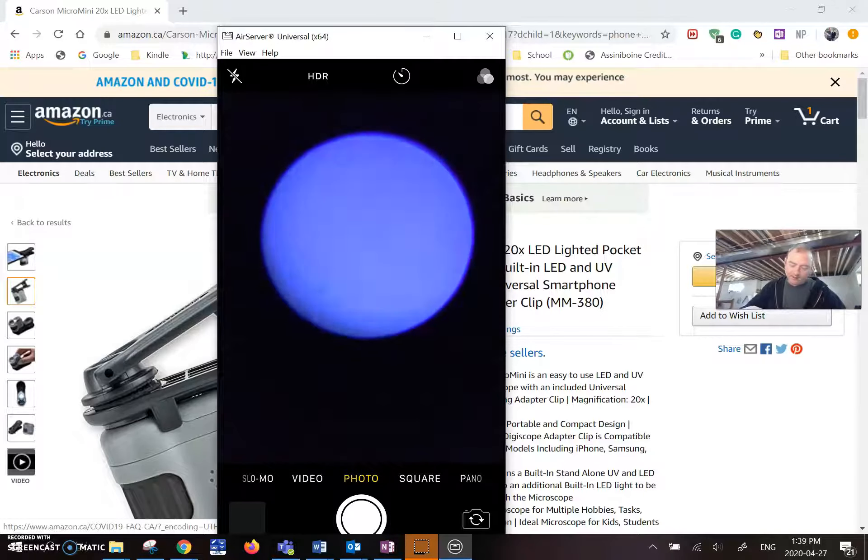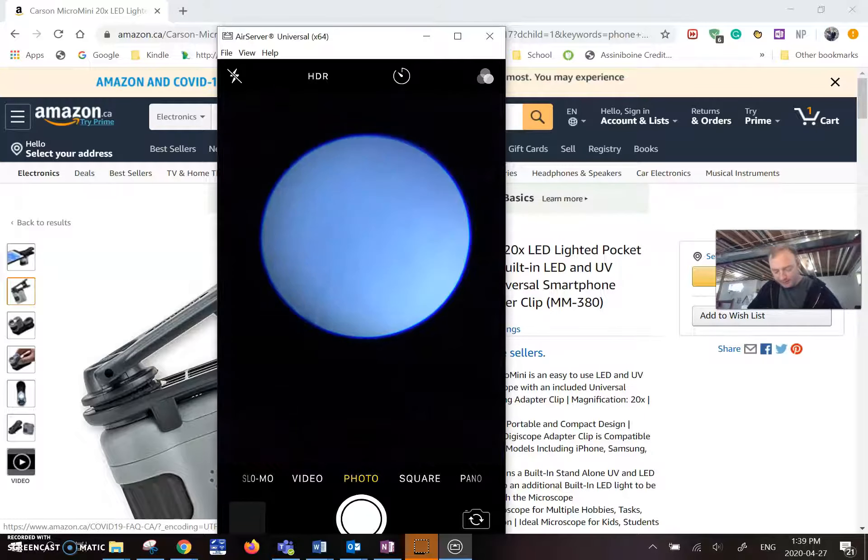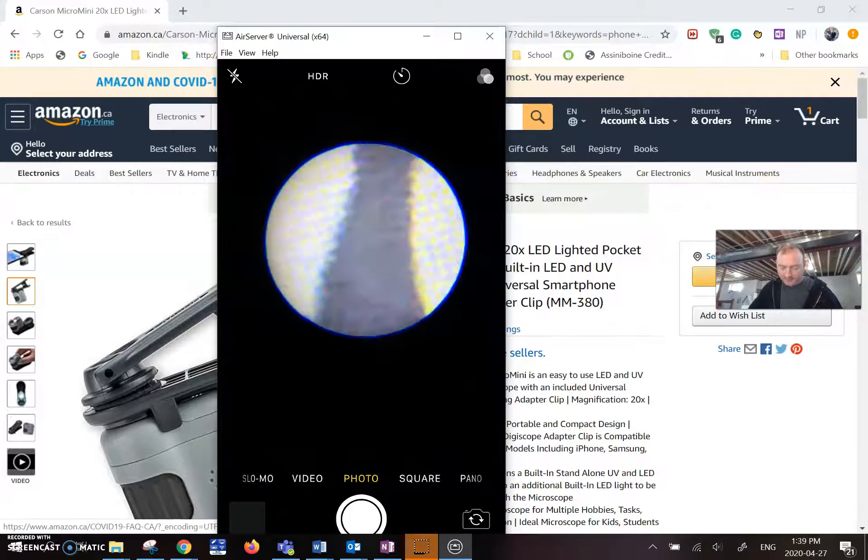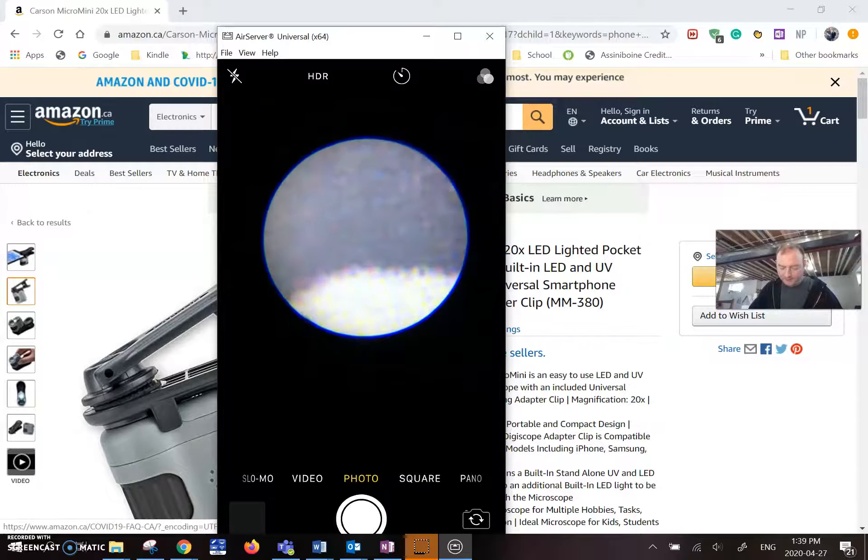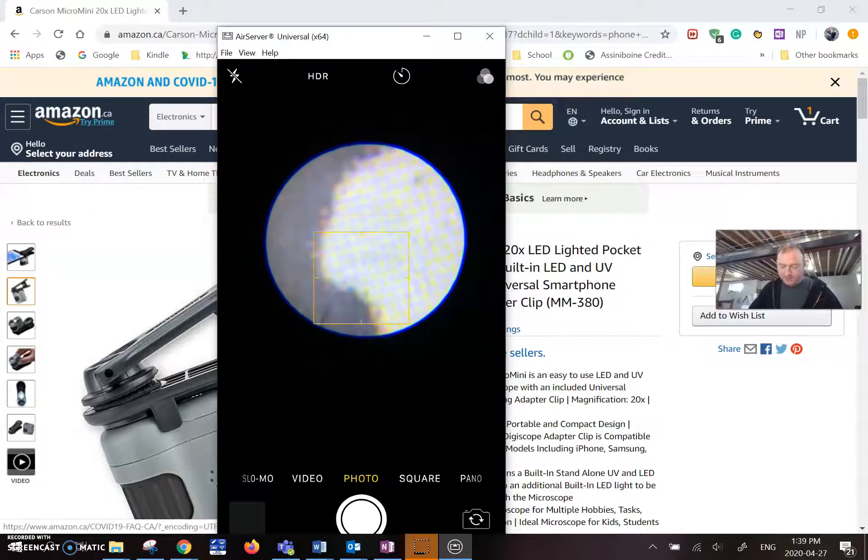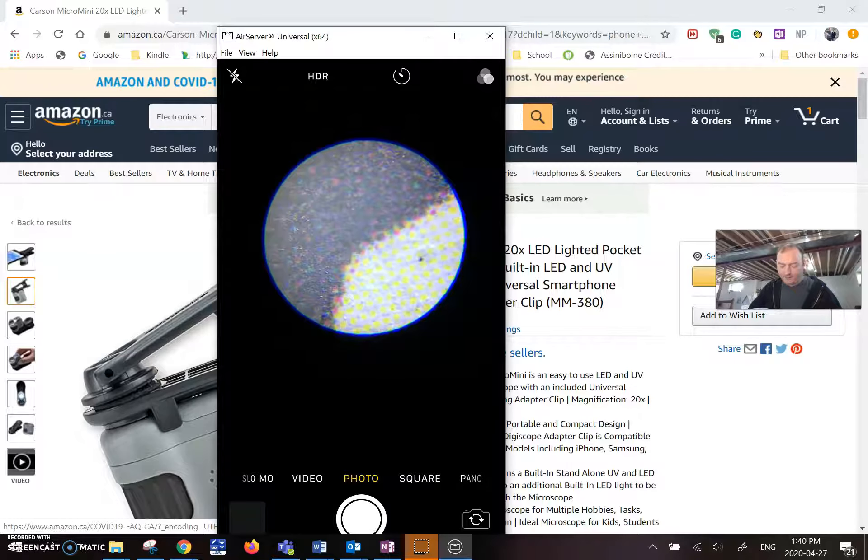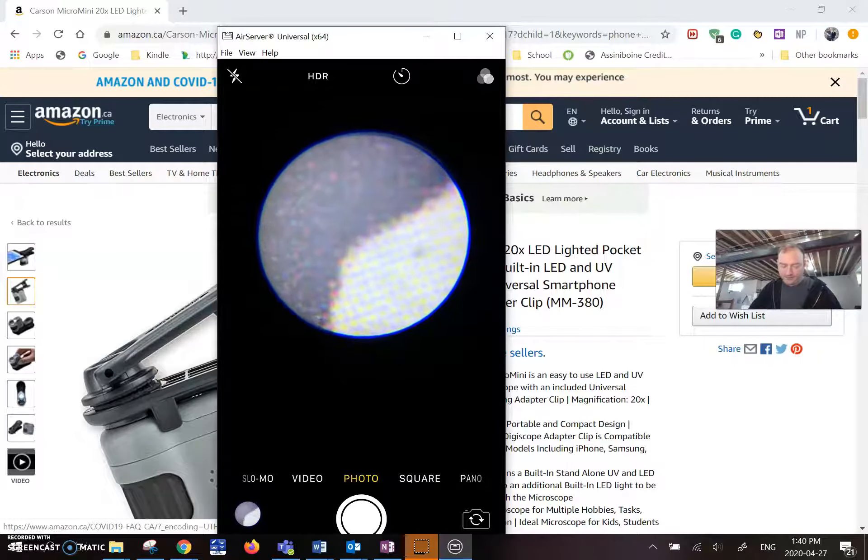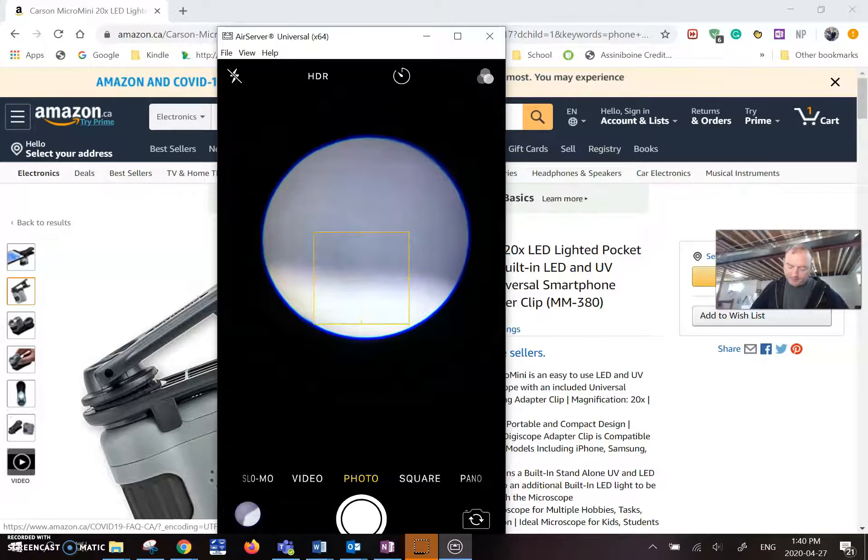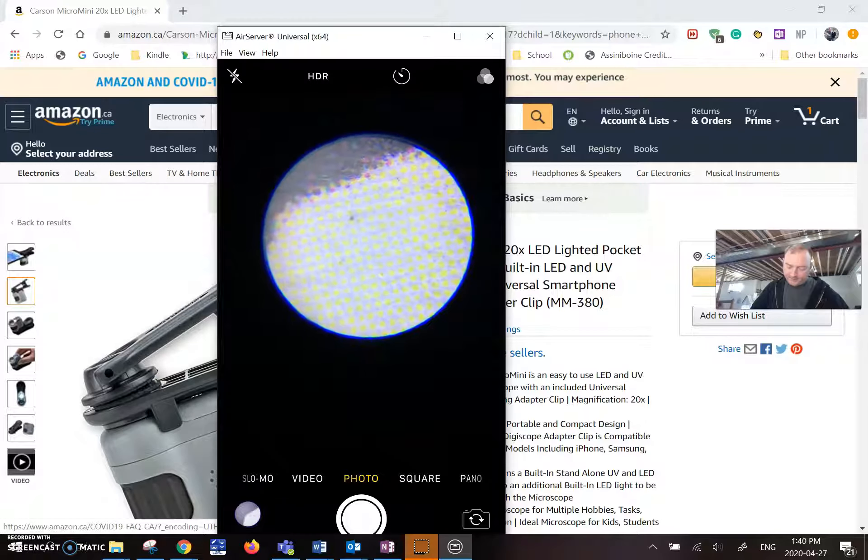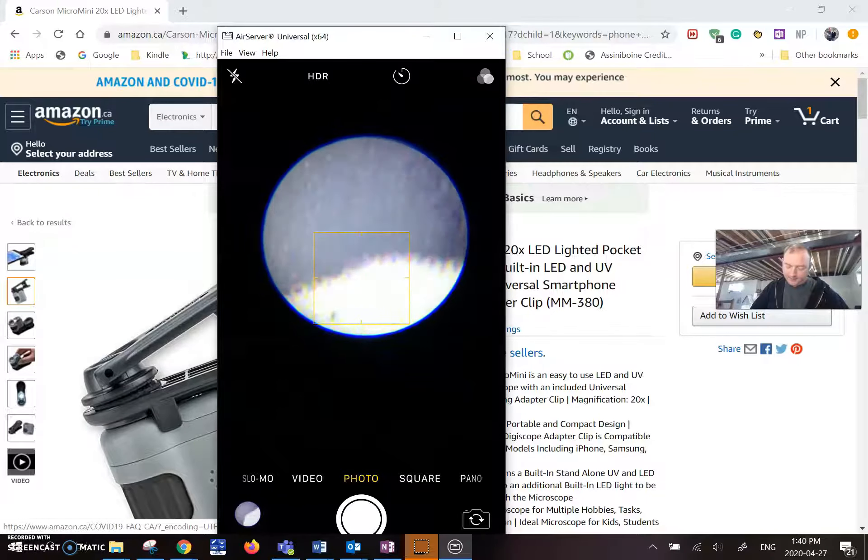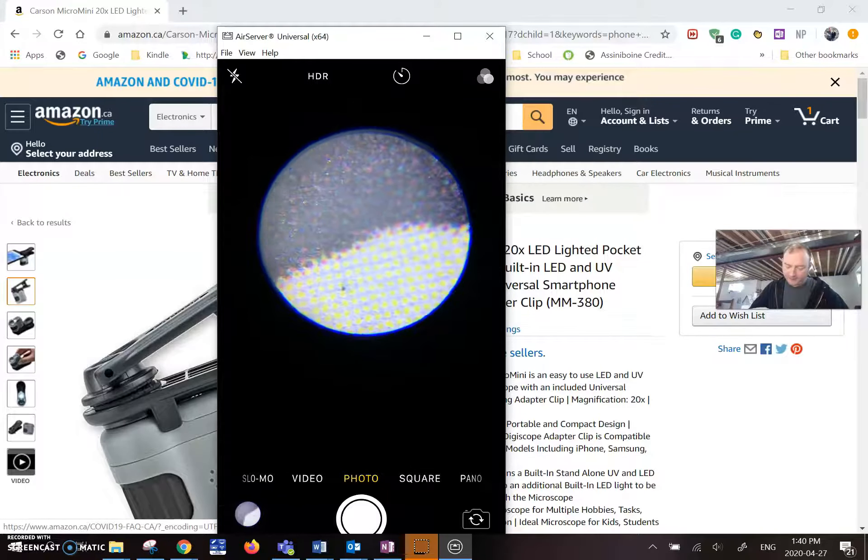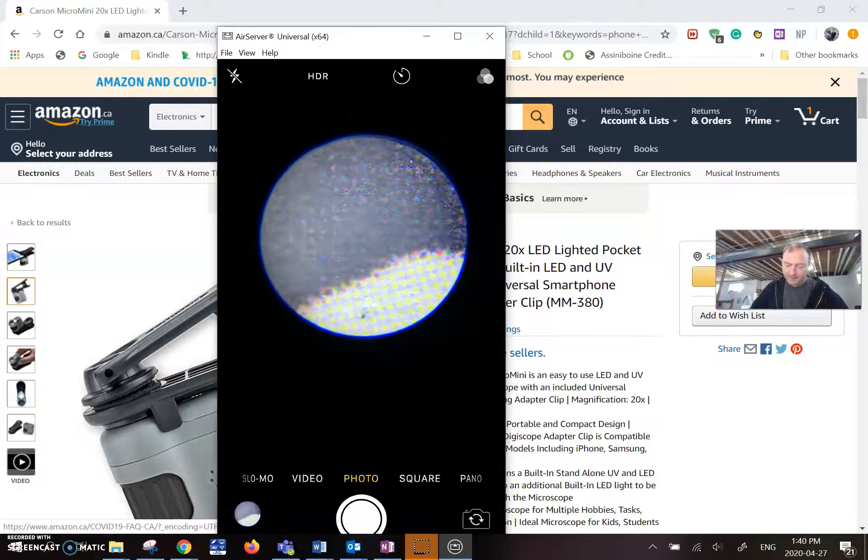And then I will turn the white light on. This really brightens things up. So I'm on the bill right now, and you can see the individual dots on the bill. Super handy. The other thing that you can do while you're at it is you can snap a photo. So I can snap a photo of what I'm looking at. But it's a little hard to keep it steady because it's 60 times. Of course, very small adjustments make for large adjustments in the optical scale. It's 60 to 1.